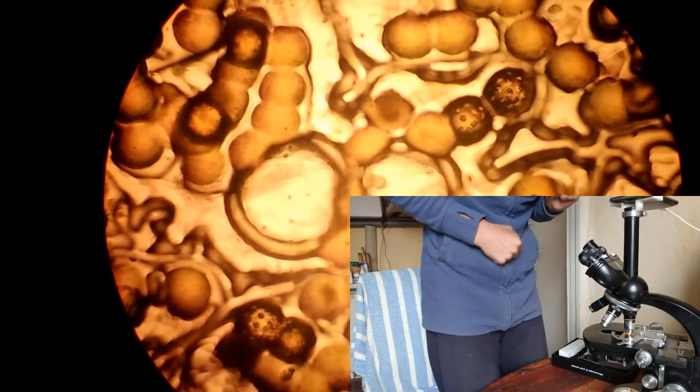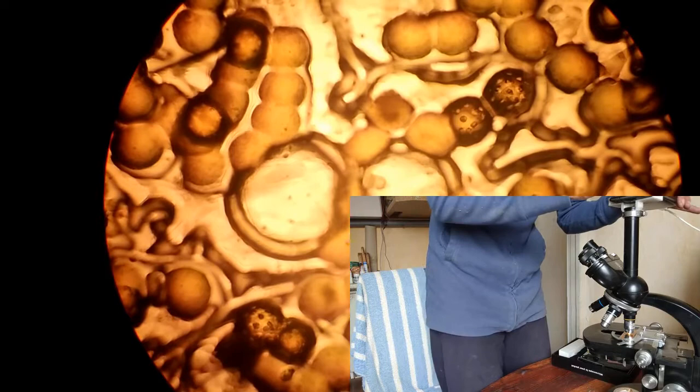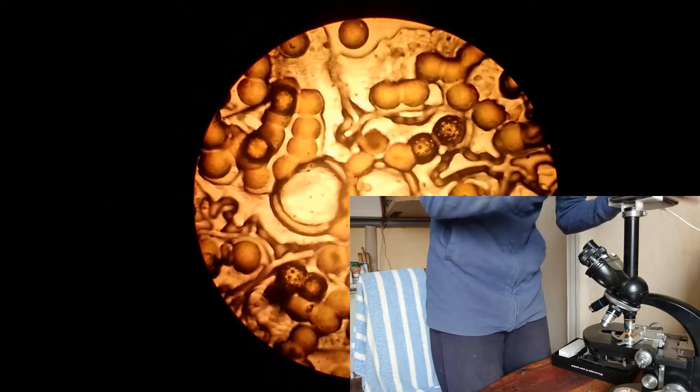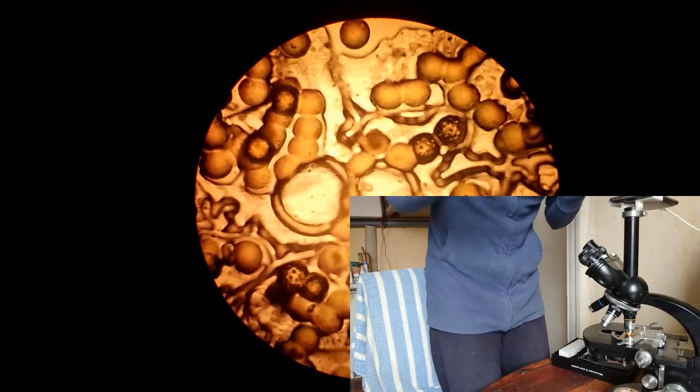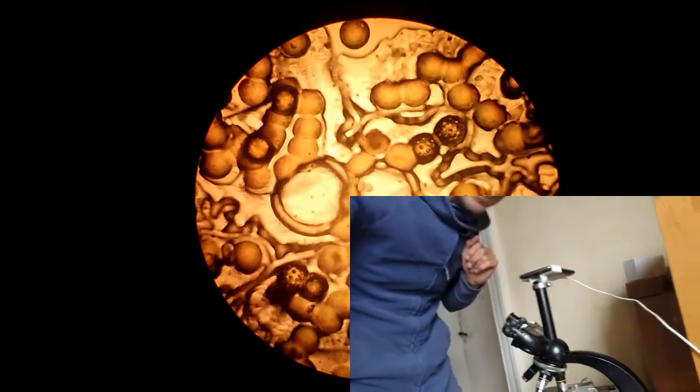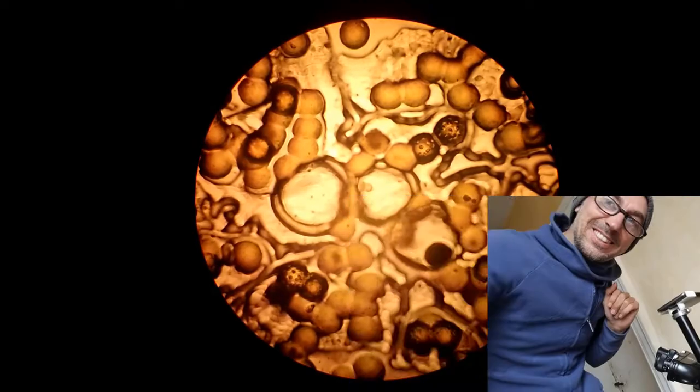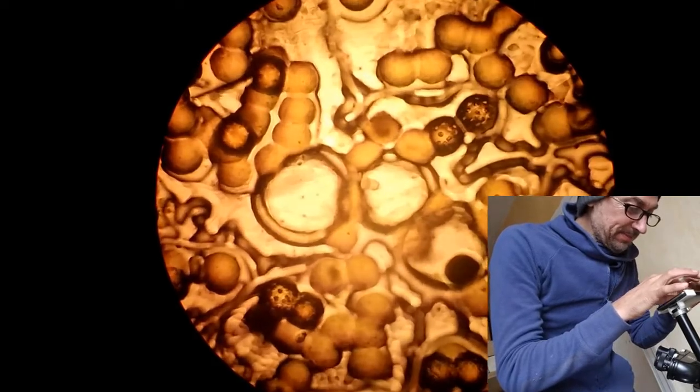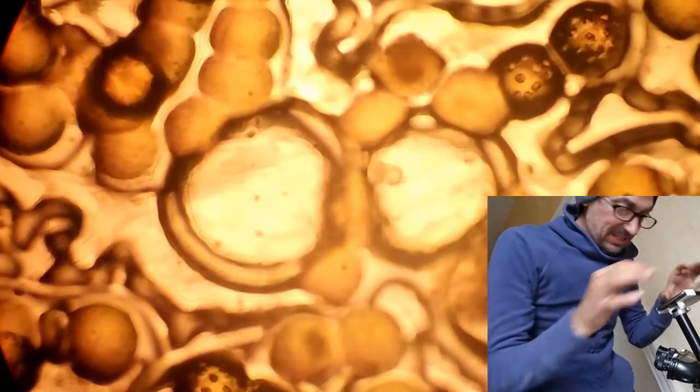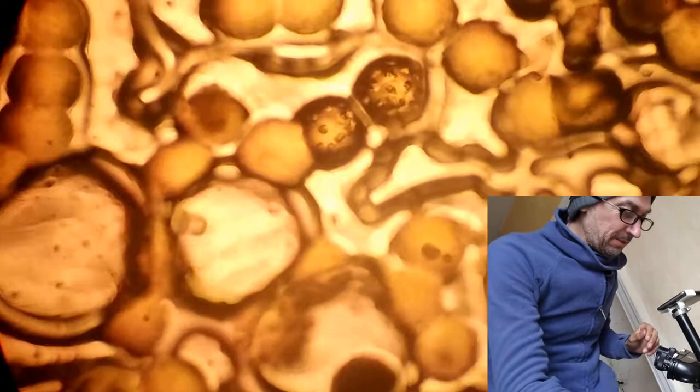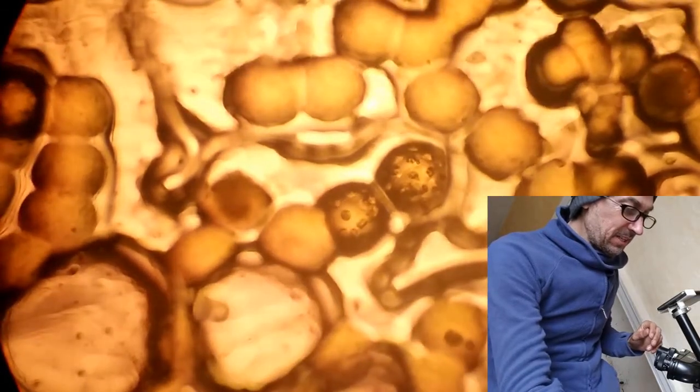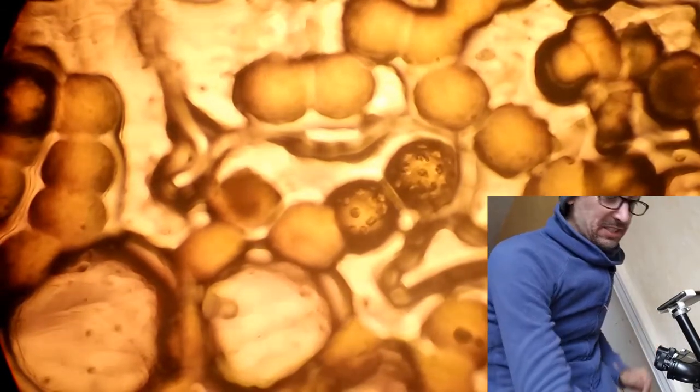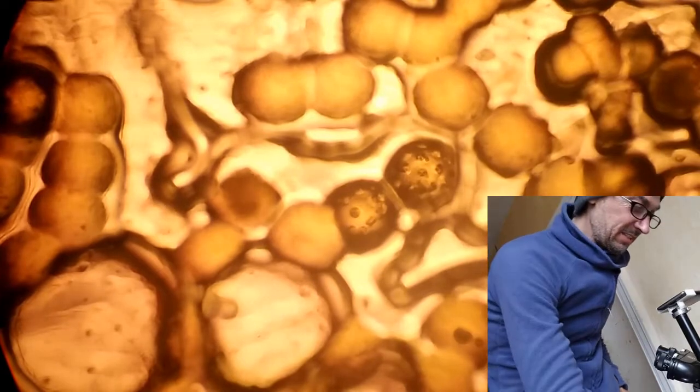Again you see this already has some magnification. You see these spikes. Let's put this in focus and try to get it sharper. This is 100x - 10 times 10.